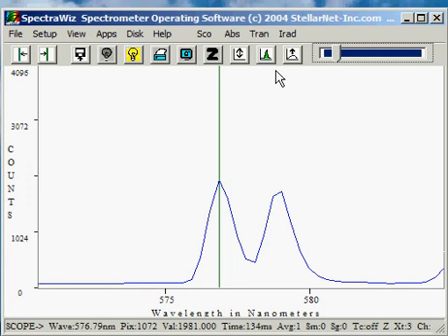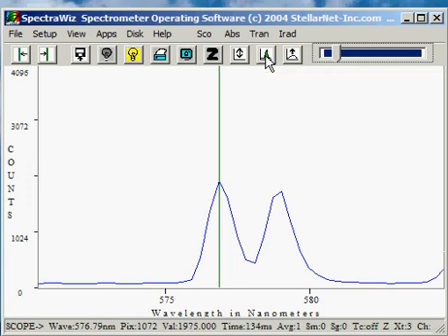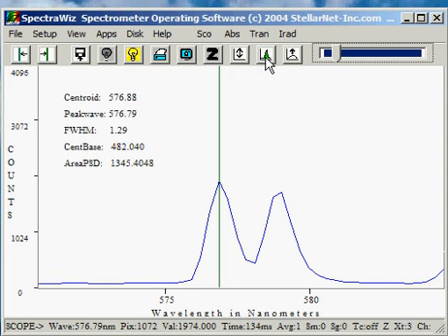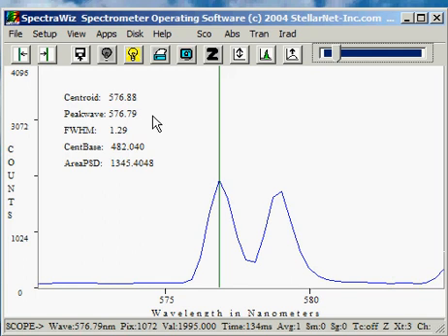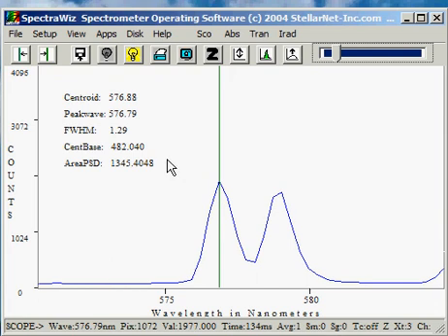The next icon is the compute area and centroid. If I left-click, I'll get a display that shows the centroid, peak wavelength, full width half max of this peak, the centroid base, and the area power spectral density.